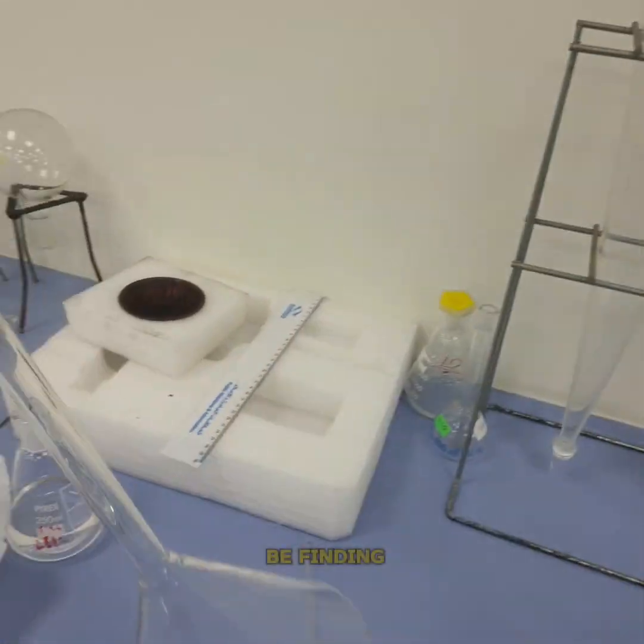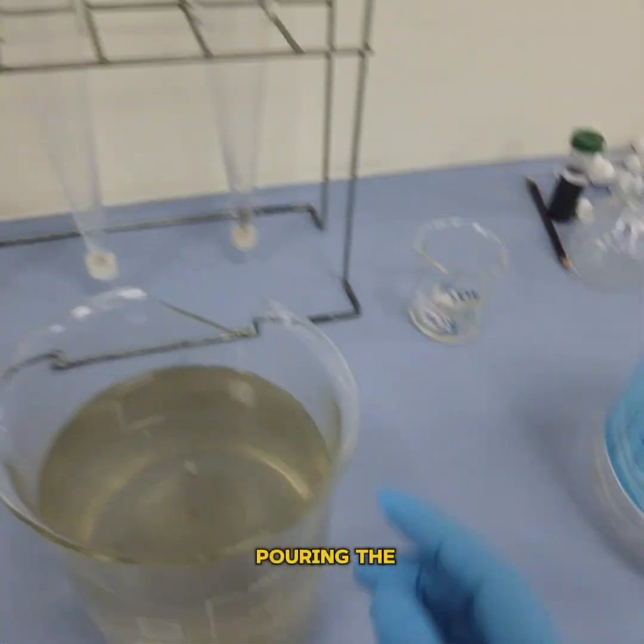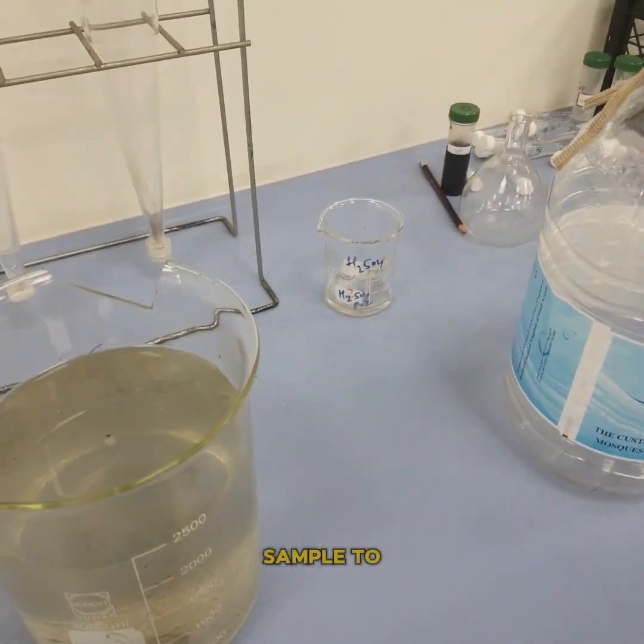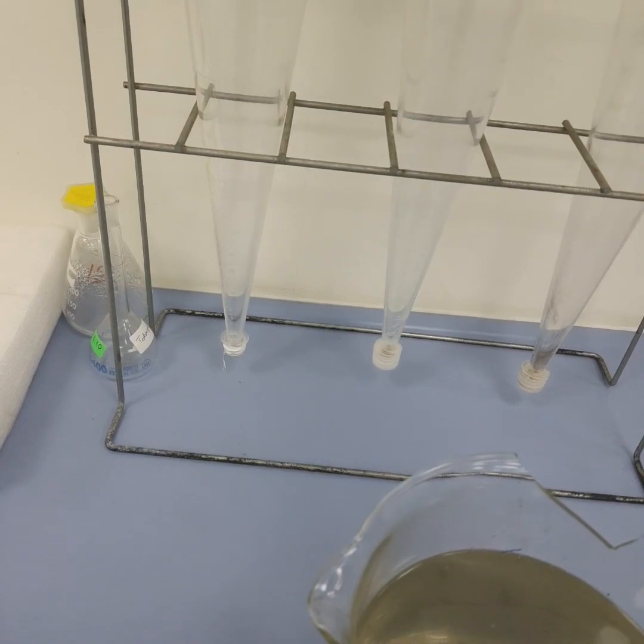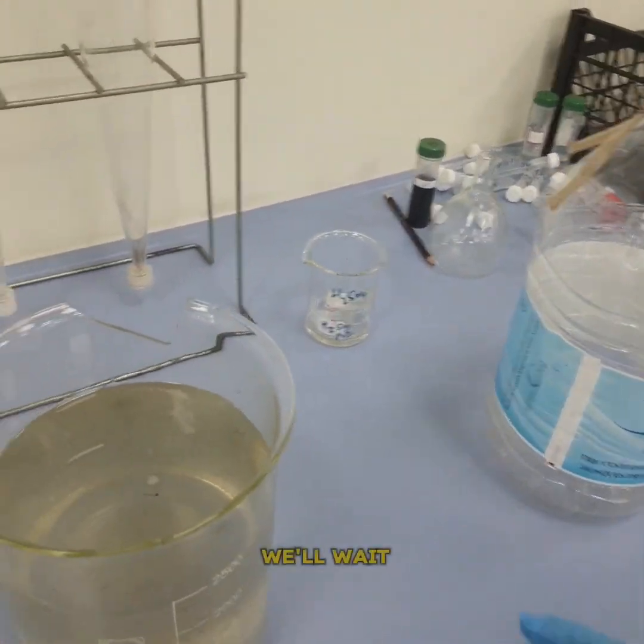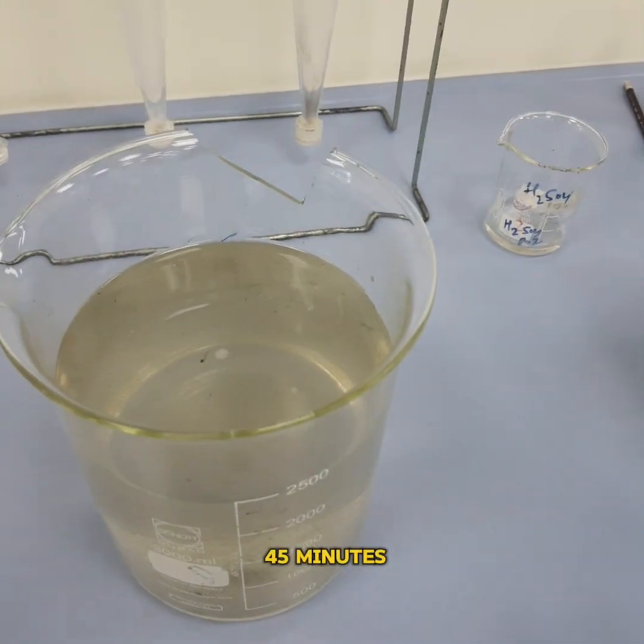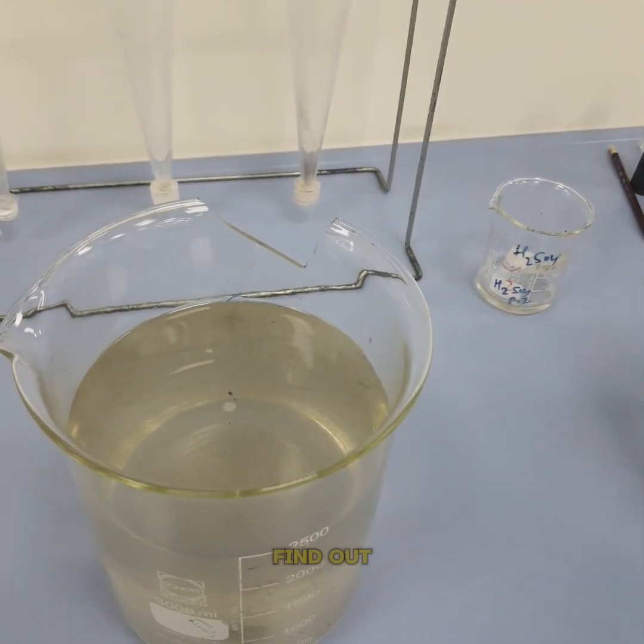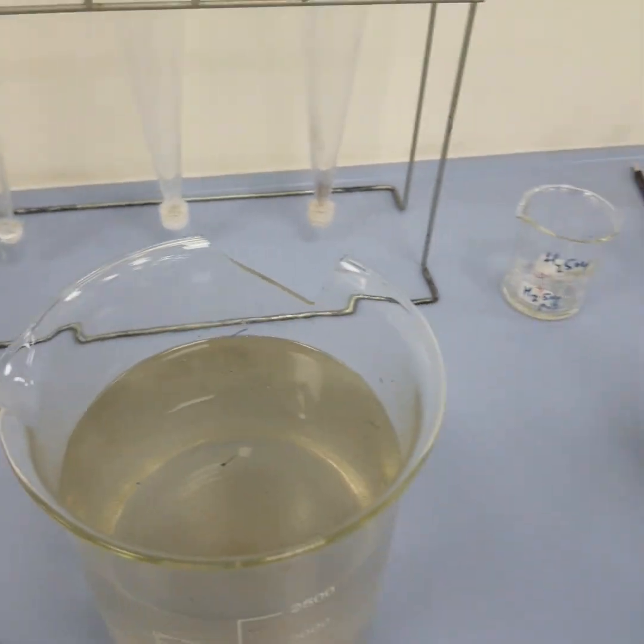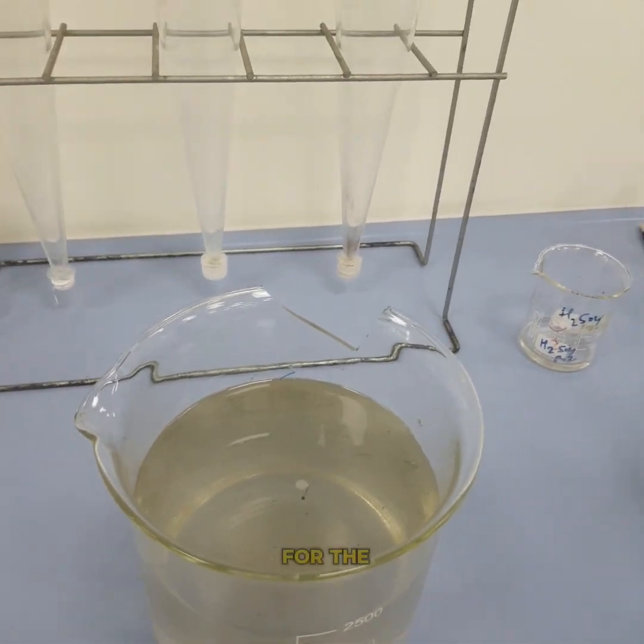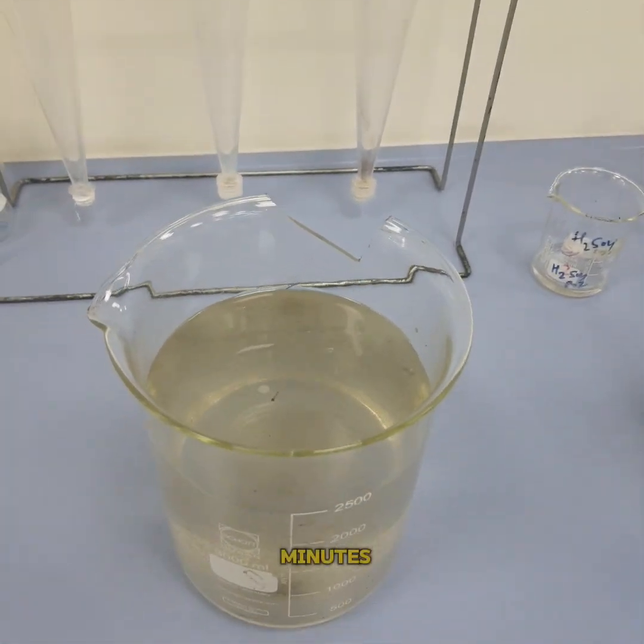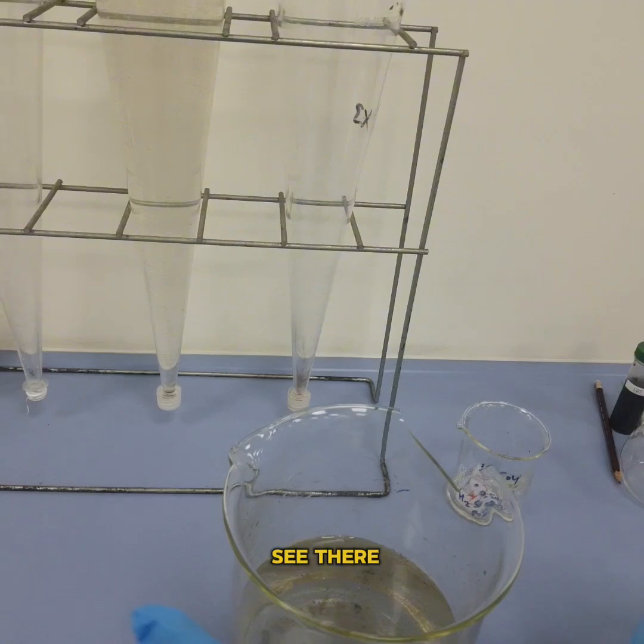Now we have an Imhoff cone which we will be finding out. We're pouring the water which is having sludge, a well-mixed sample, to the Imhoff cone. The graduation is around one liter and then we'll wait for around 30 to 45 minutes and then we will find out the settleable solids. This is very important in finding out the SVI and SDI for the sludge sample. So let's pour and wait for 30 to 45 minutes.